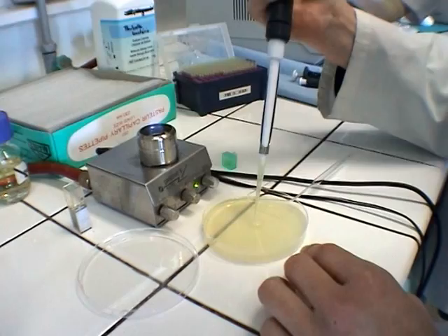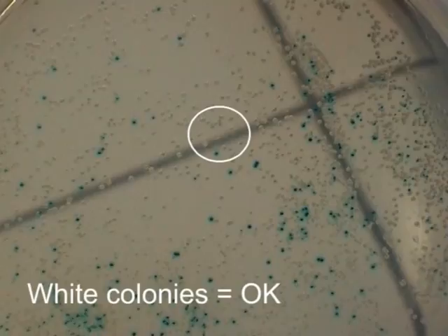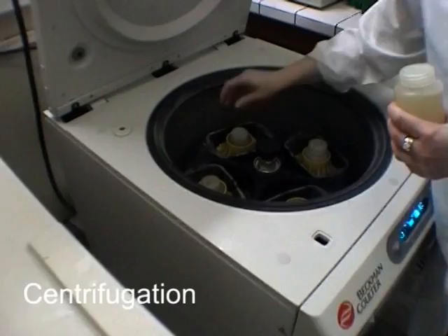Next, the bacteria are spread over a culture dish, and the bacterial colonies that have incorporated the plasmid correctly are identified by their white color. A bacterial colony containing the correct gene is then grown as a culture. After one night of incubation at 37 degrees centigrade with constant shaking, the cloudy appearance of the culture confirms that the cells have multiplied. The cells are separated from their food and waste products by centrifugation.